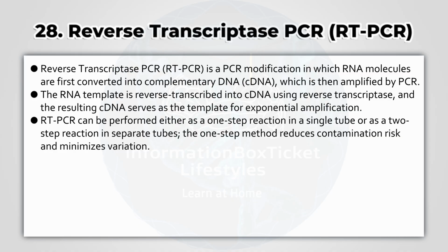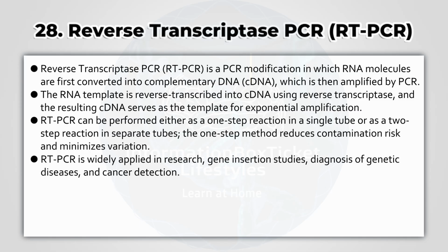RT-PCR can be performed either as a one-step reaction in a single tube or as a two-step reaction in separate tubes. The one-step method reduces contamination risk and minimizes variation. RT-PCR is widely applied in research, gene insertion studies, diagnosis of genetic diseases, and cancer detection.